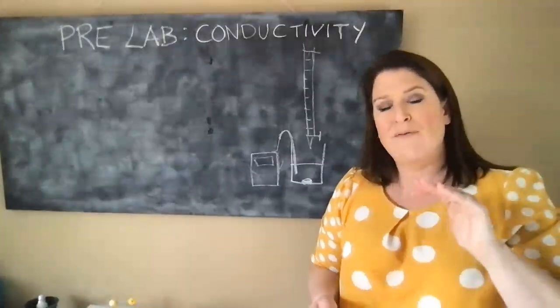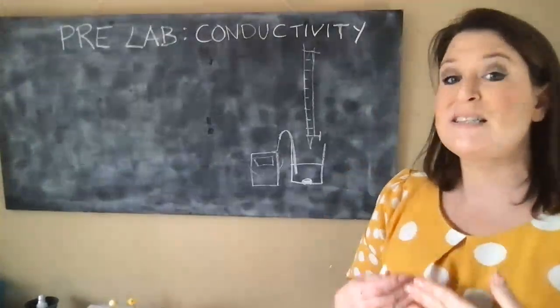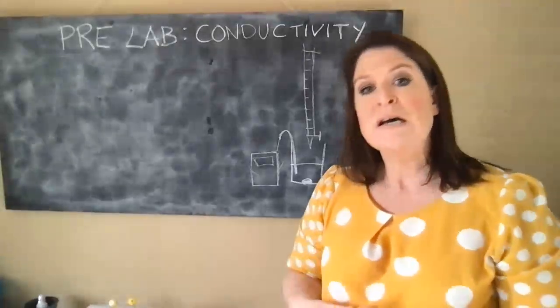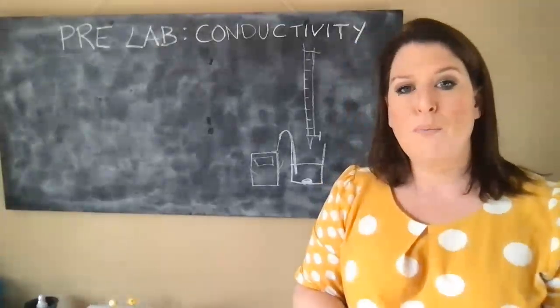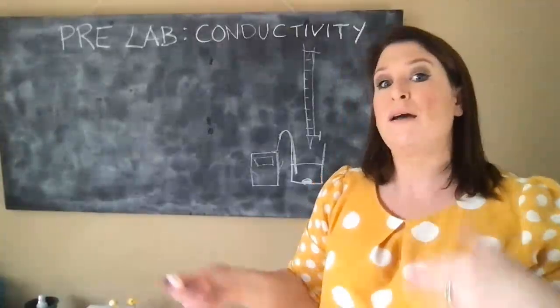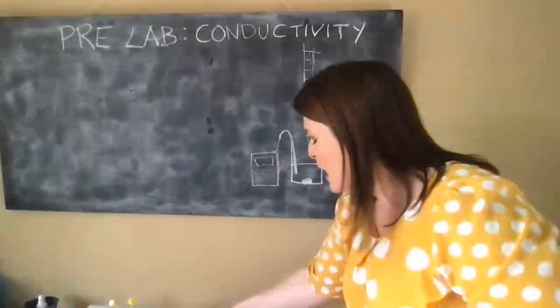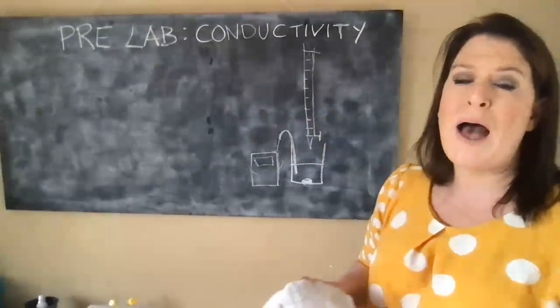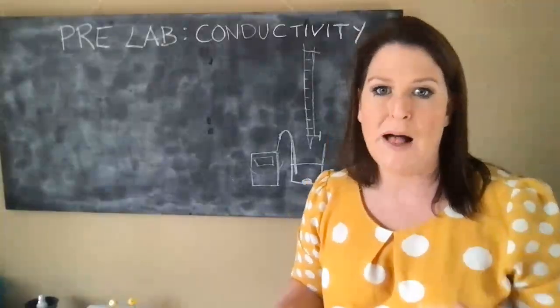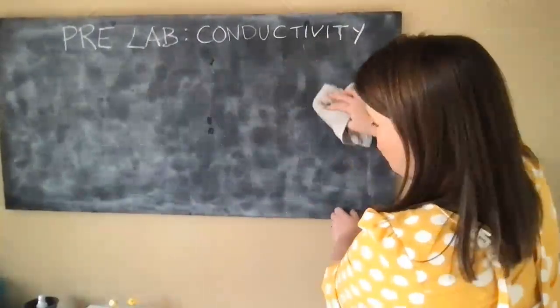I want to talk to you now very briefly about part A, and I'm purposely finishing with this because this is the starting point in the lab. So I want to go back and discuss the use of the probe, what the difference between conductance and conductivity is, and why we have to look at the two factors and not just the one, and show you how to calibrate your probe. This is part of the post-lab talk as well.